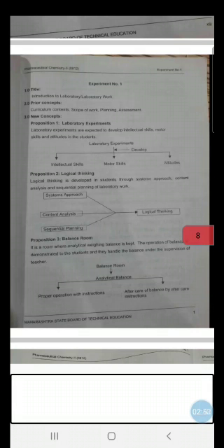Now you all know that whatever chemicals you require for your day-to-day practicals, they are kept in our laboratory chemical store, where a record is also maintained of which chemicals we get issued from the store. And here certain solutions which you require for the practical are also prepared in this room only. Beside that, there is a balance room which has an ample number of analytical balances manufactured by Keroy company.